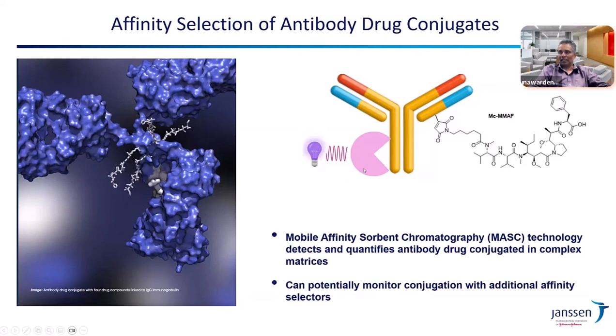So what's possible here is that we can definitely determine the titer of an ADC, which I'll show in a few minutes. But what we can potentially do in the future is to look at the conjugation efficiency by dialing in different types of reagents that are selectively binding to the drug itself, which is shown here. It's not currently available, and there's a thought that this could be used to look at the FRET from the first fluorescent tag to another reagent that binds to the payload. And this level of detection can give you specificity as well as look at the conjugation levels of this drug conjugate.